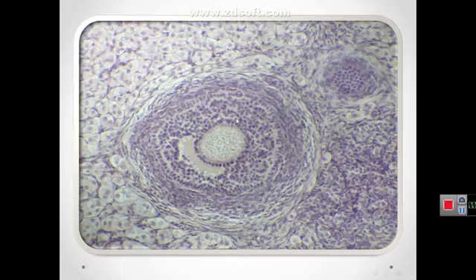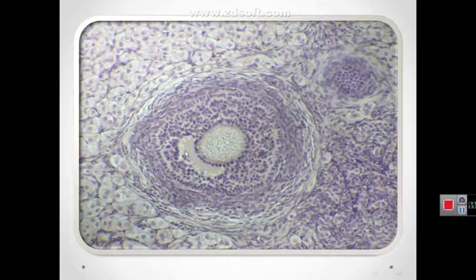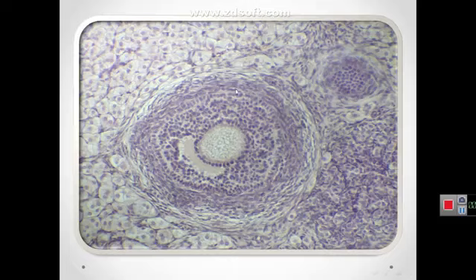As the primary follicle grows, it moves deeper in the ovarian cortex. Within each follicle, small spaces appear between the granulosa layers as the cells secrete follicular fluid. This fluid accumulates, the spaces enlarge and gradually coalesce to form the antrum. The follicle is now called a secondary or antral follicle.